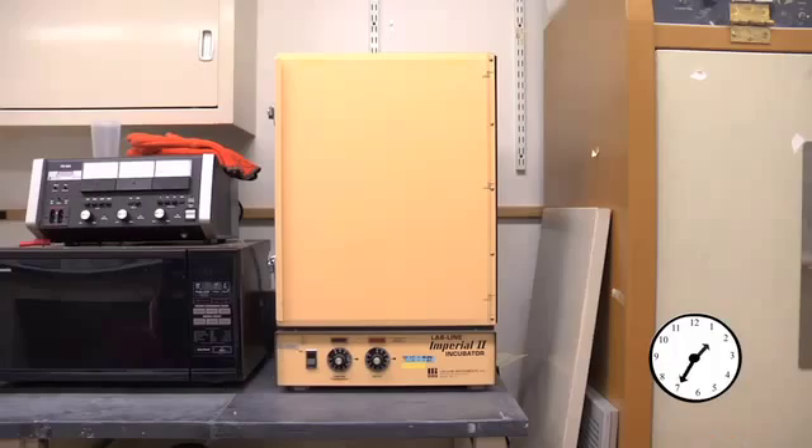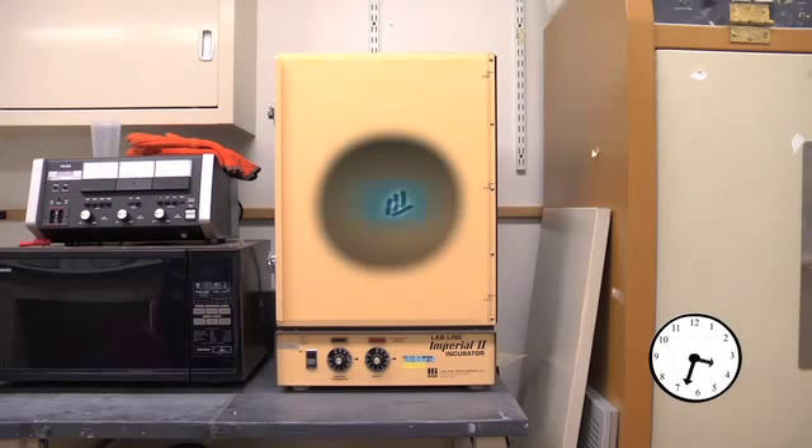And now we wait for growth. The bacteria will replicate approximately once every 30 minutes. You can imagine that in a few hours you'll get millions of bacteria from each one.